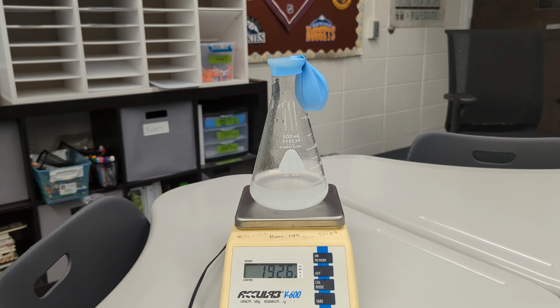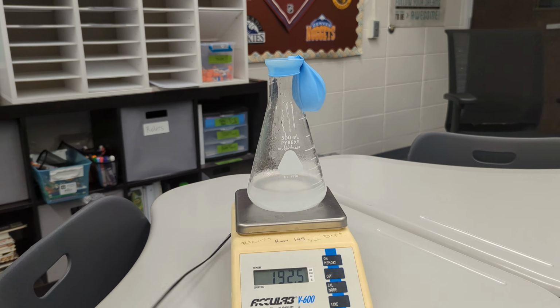But what the law of conservation of mass tells us is that in a closed system, and I've closed this system by placing a balloon over the top, which should not allow gas or hardly any gas to escape, even when a chemical reaction occurs, the total mass before and after that chemical reaction should stay the same. So right now we're looking at a mass of 192.6 grams, and I'm now going to pour the baking soda in.